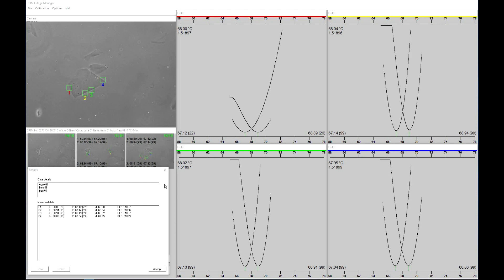Here we have the final results from the four edge boxes selected. For each of the four measurements we have a heating and cooling cycle with an average of the two, and then the calculated refractive index from each edge box.